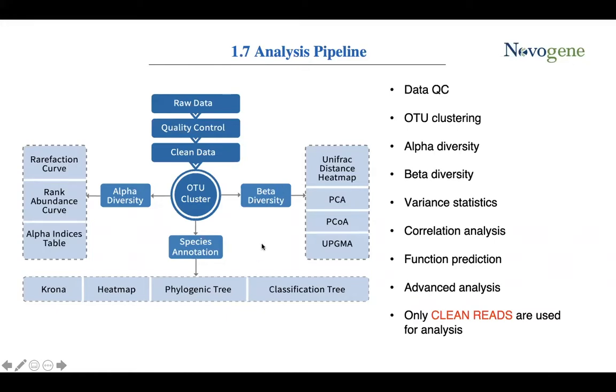And aside from the analysis items shown in this pipeline, we are also able to do a lot more advanced analysis, like variance statistics, correlation analysis, and functional predictions using the clean reads we just got. And next, I will walk you through the analysis parts individually.